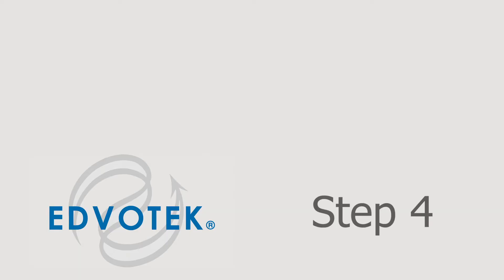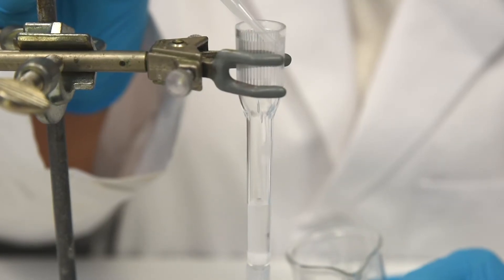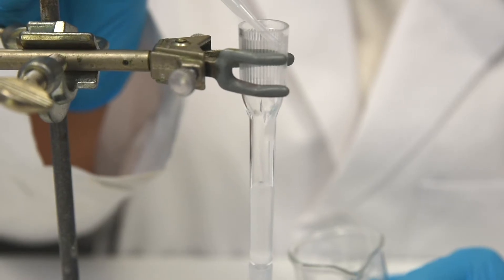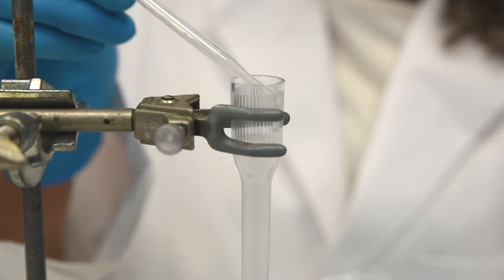Step 4: Carefully pipette 4 ml of the mixed slurry into the column by letting it stream down the inside walls of the column.